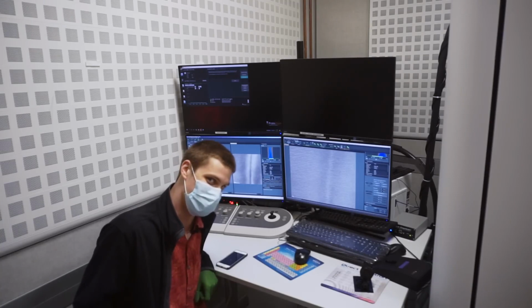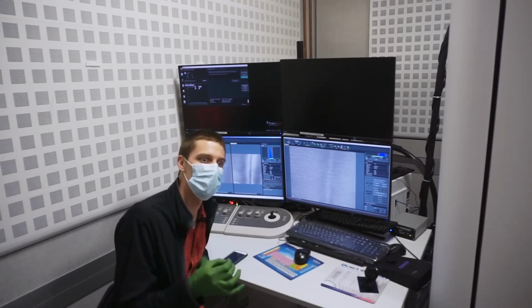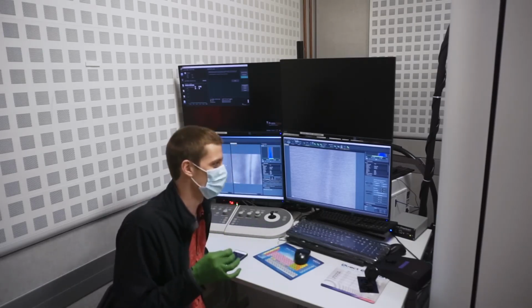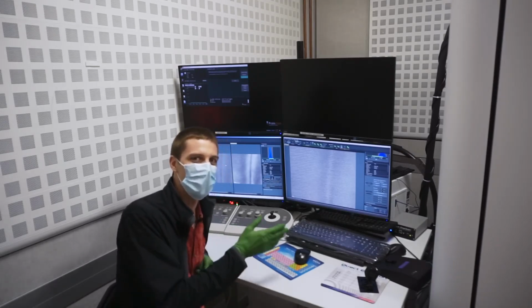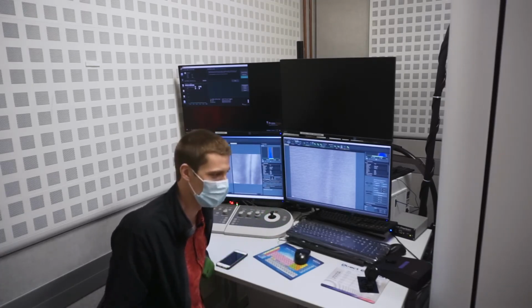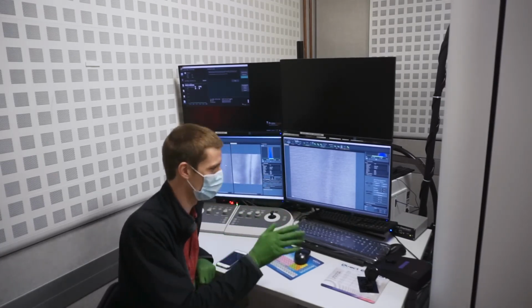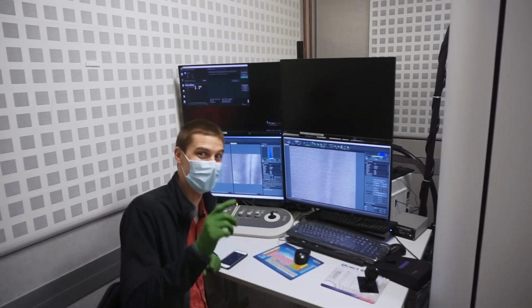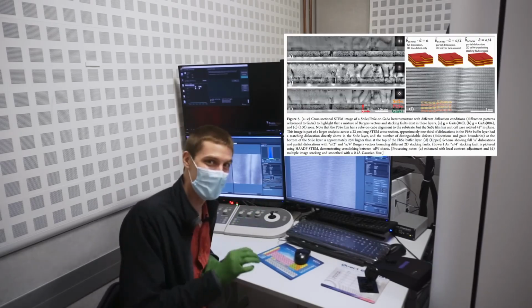This was annoying. I think this is the first time that I've ever gone out looking for a particular defect. Like, I want to see this thing, and wasn't sure that it existed. This was like 3 hours of tedious focusing on a really old sample. This is like a more than a year old sample that came out of the FIB. And it's all warped, which means it's really difficult to focus on, and it kept losing focus continuously. But I did it. So now I get to say in a paper that this defect exists in tin selenide because I have a picture of it. That is science.